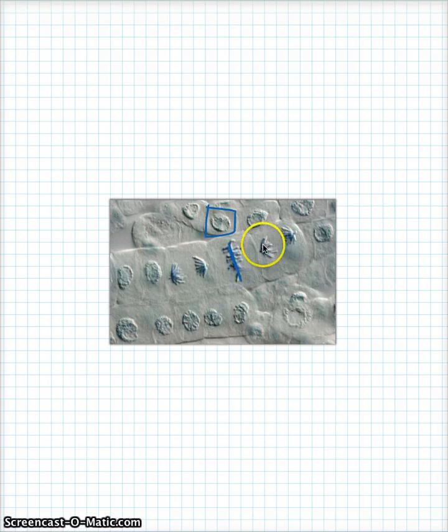Here's metaphase. Anaphase. Another anaphase. You see how much easier this is when you start to tell what's going on? I hope you think that anyway.